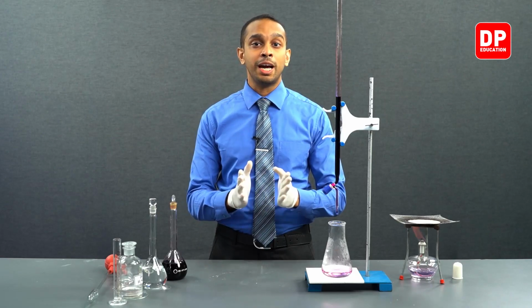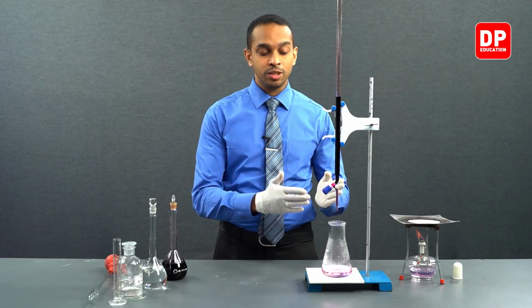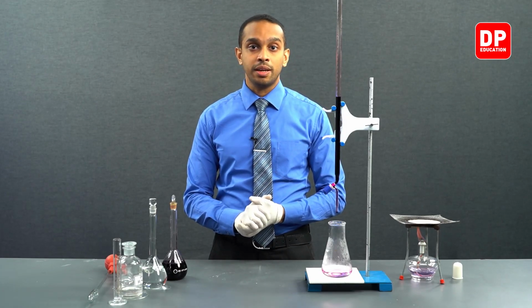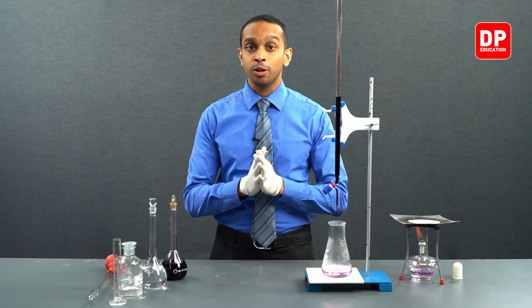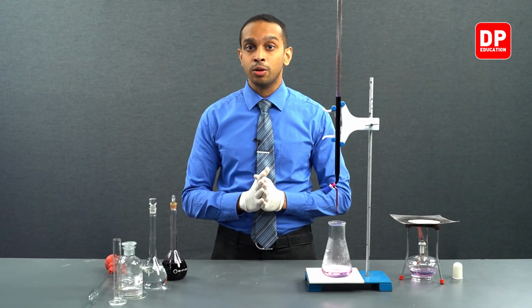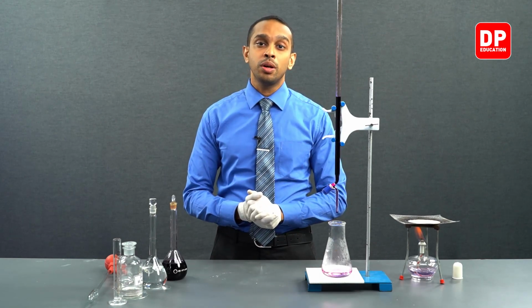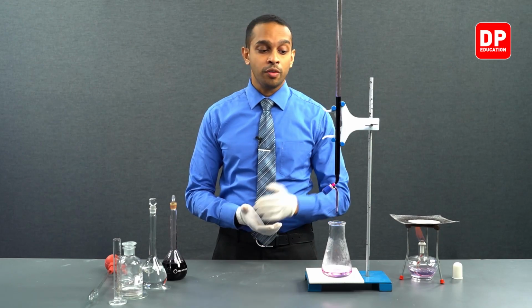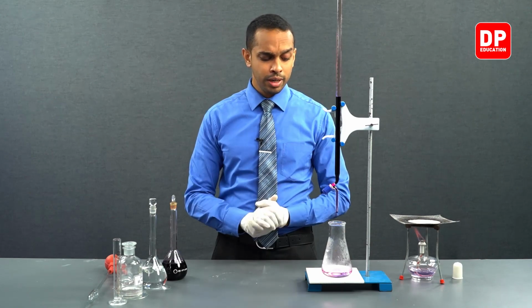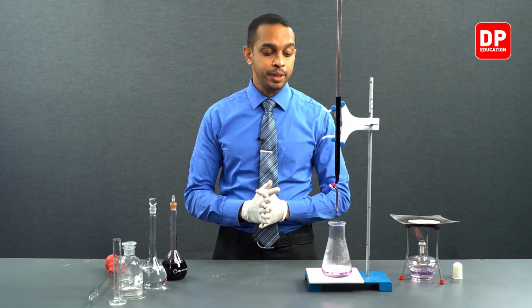Whenever we have 3 measurements, we can be sure that the method that we followed was correct, and if the 3 measurements are closely related to each other, we can argue that the measurements are concordant or precise, so that we can move on to calculate the concentration of the potassium permanganate in this burette. So let's move on and try to do 2 more titrations.